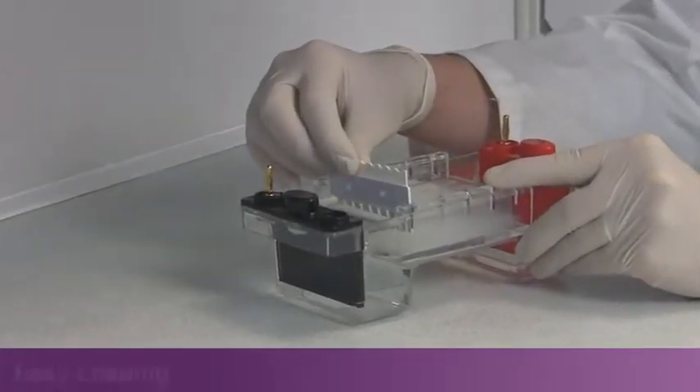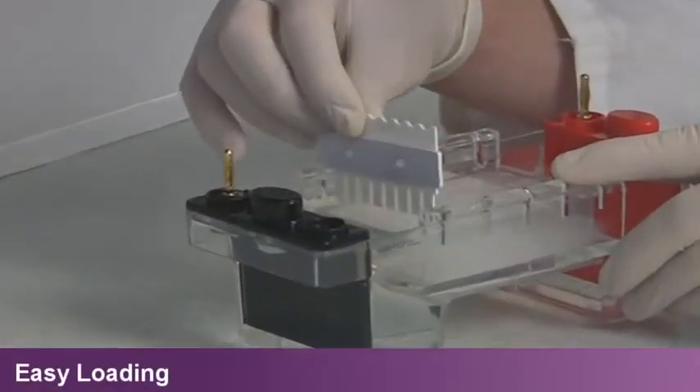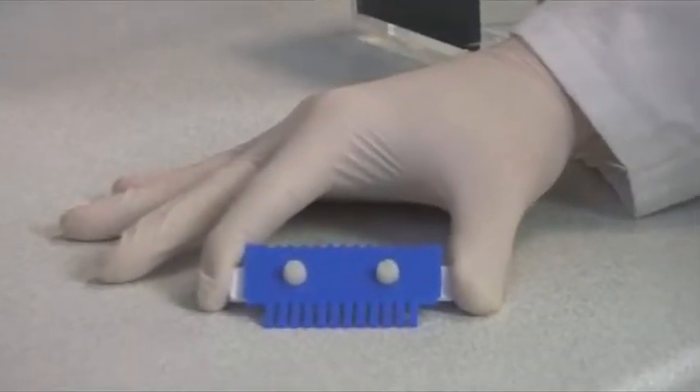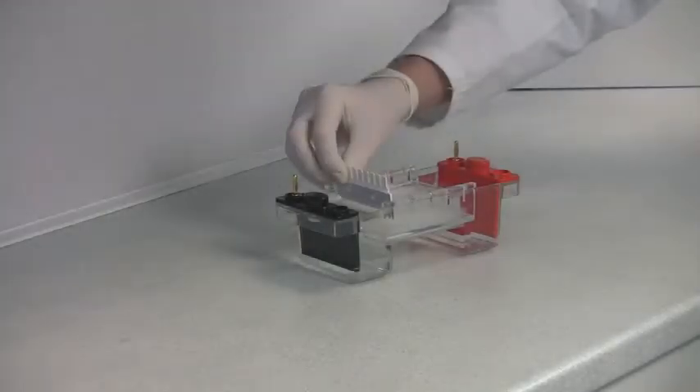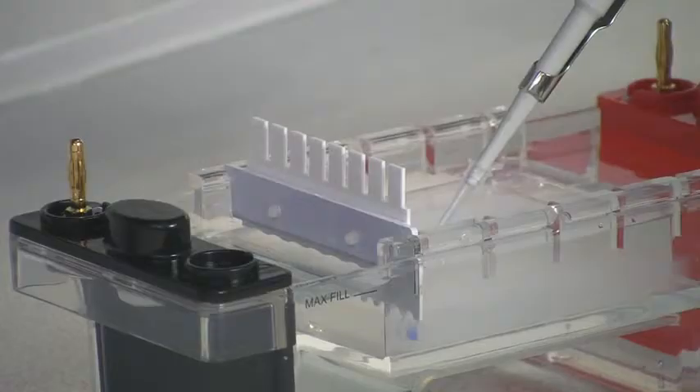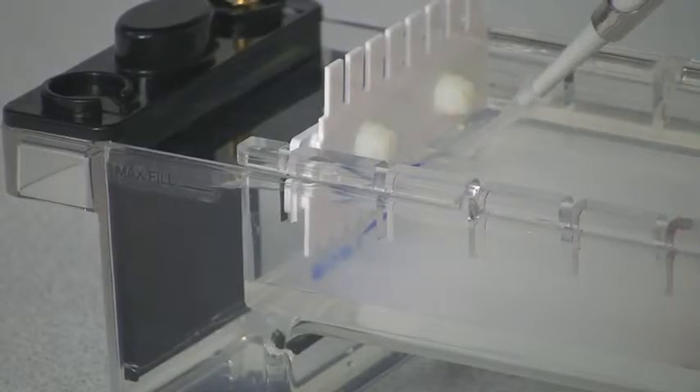Height adjustable combs provide full user control over well depth and sample volume. They are colour coded according to thickness. Each comb may be reversed following casting to reveal a convenient loading template for single and multi-channel pipettes.